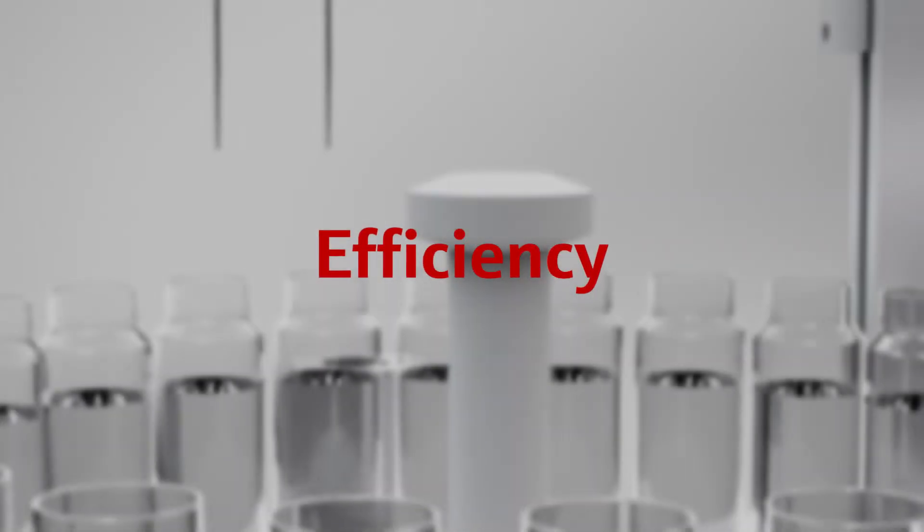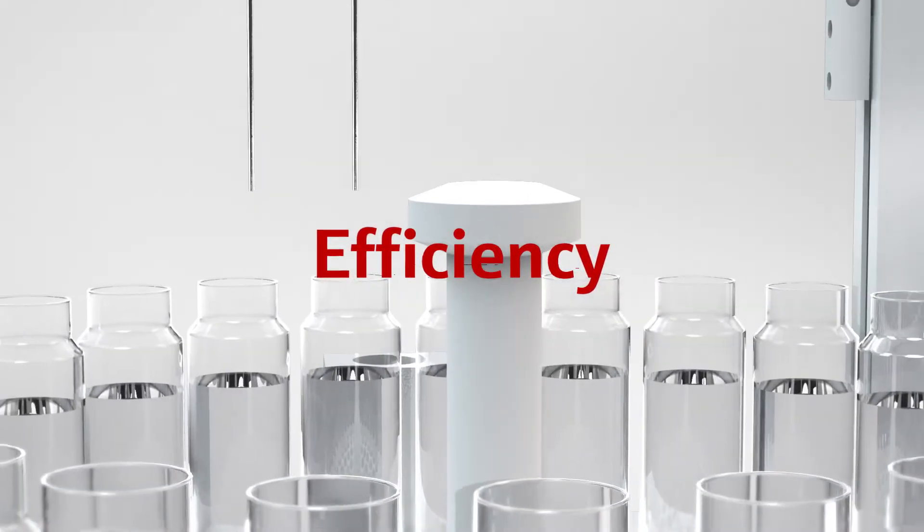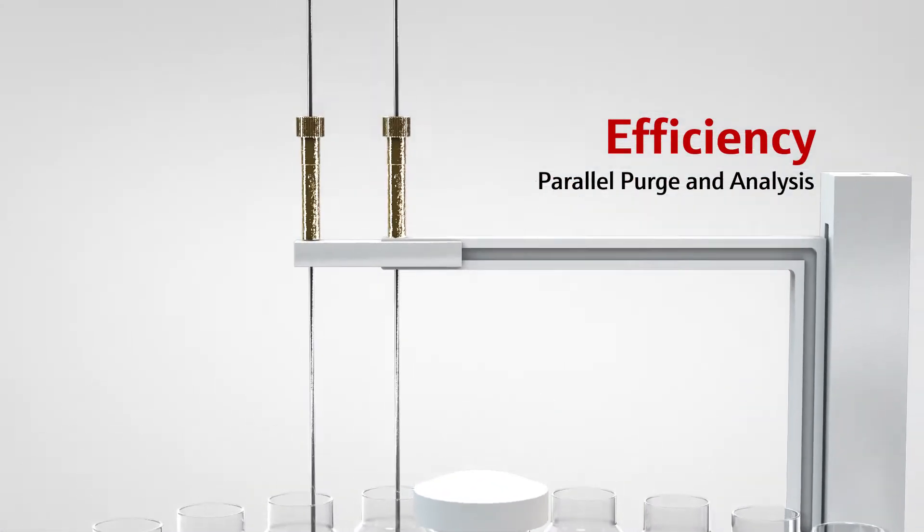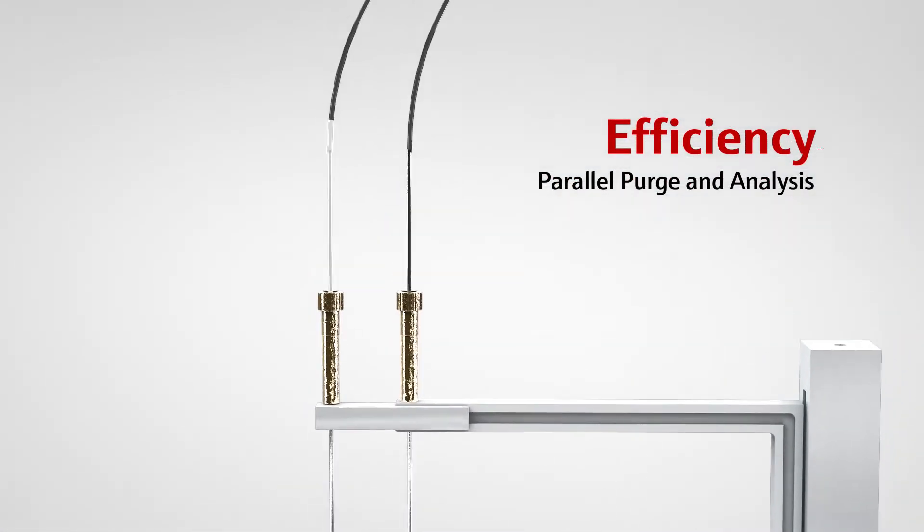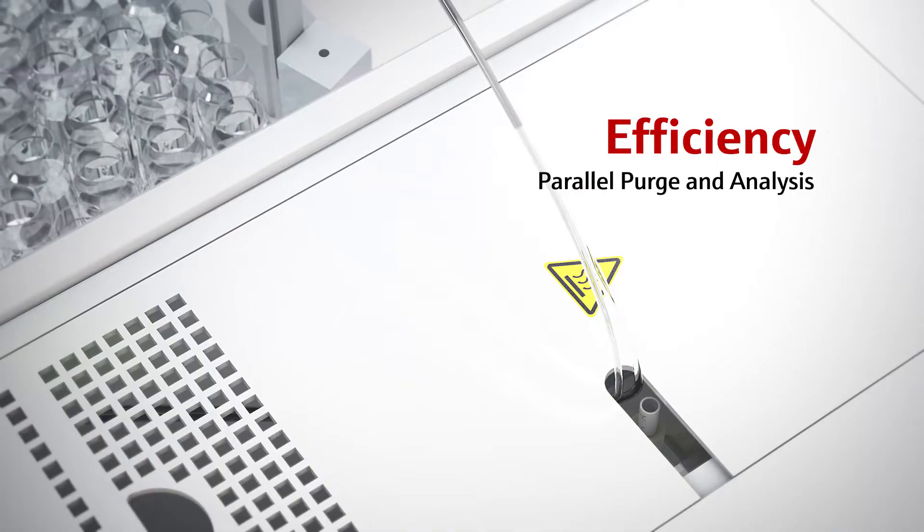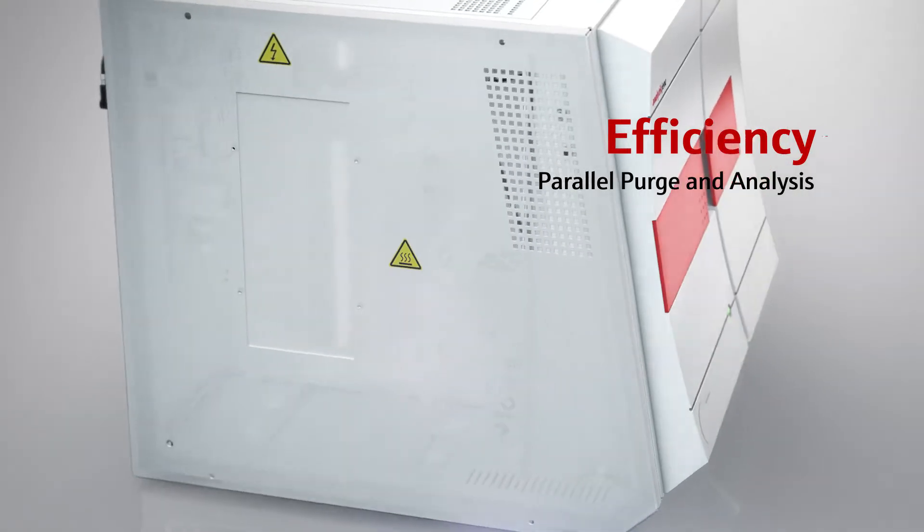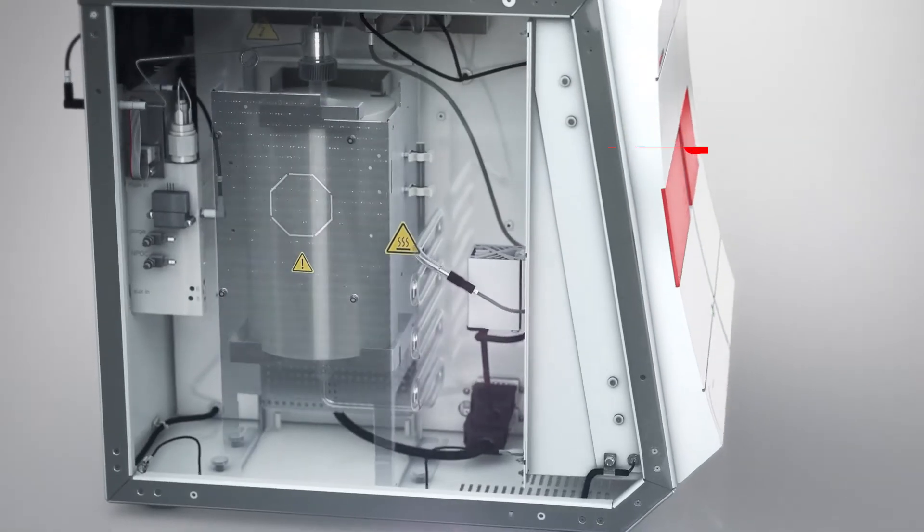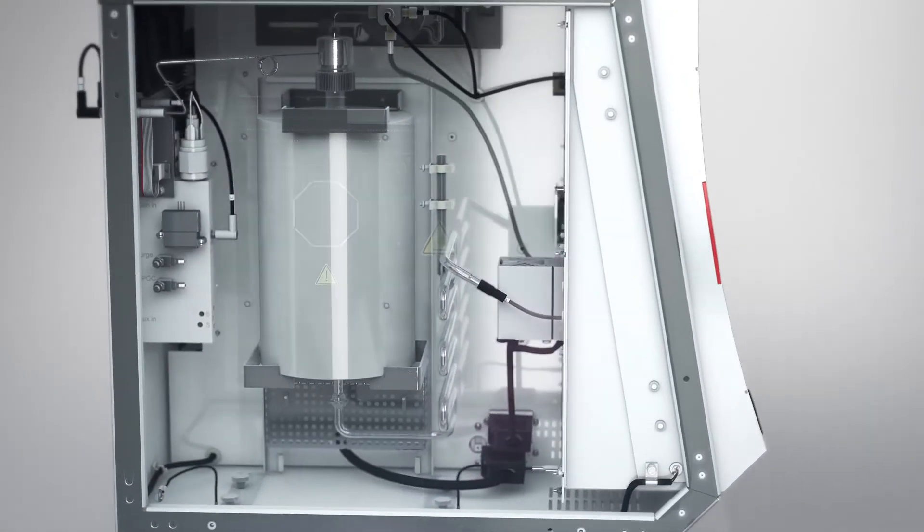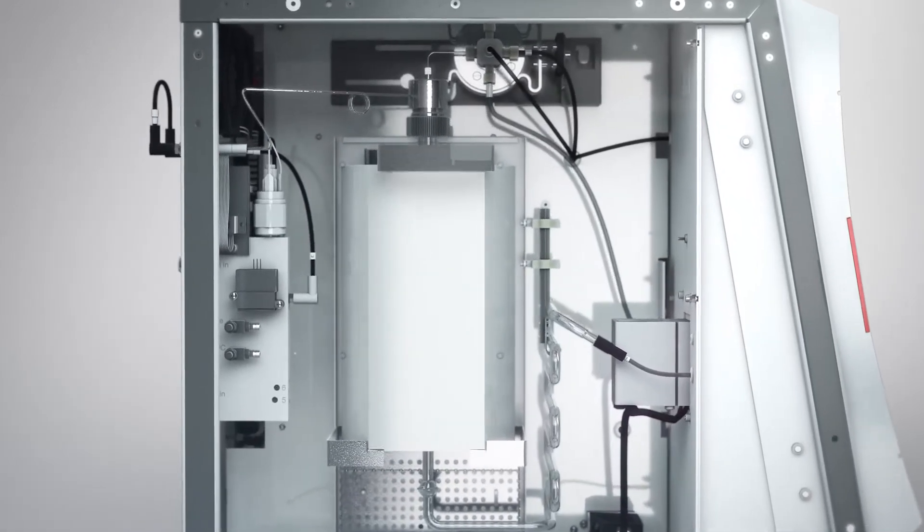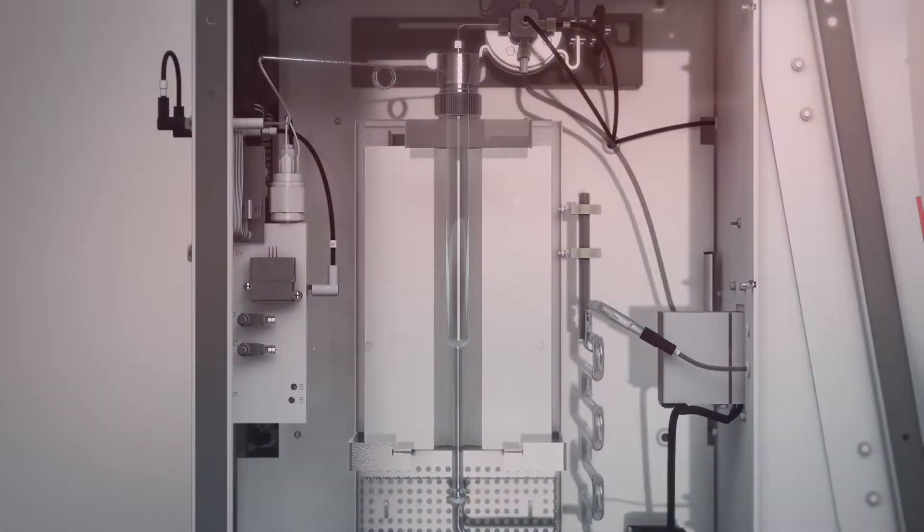Thanks to our parallel purge and analysis approach, while you analyze one sample, the next one is already prepared. Multi-NC stands for the fastest way to determine the most diverse samples.